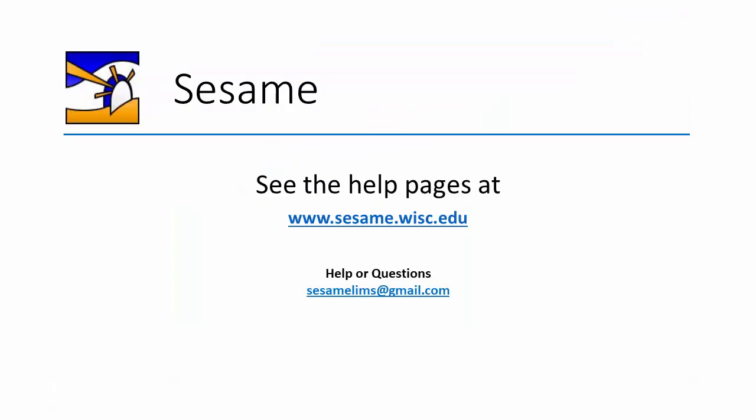There are other videos covering the use of protocols in Sesame in more detail. These videos cover the basics of creating a protocol to more advanced features. Please visit our website for these videos and for additional videos, help pages, and more information about Sesame.